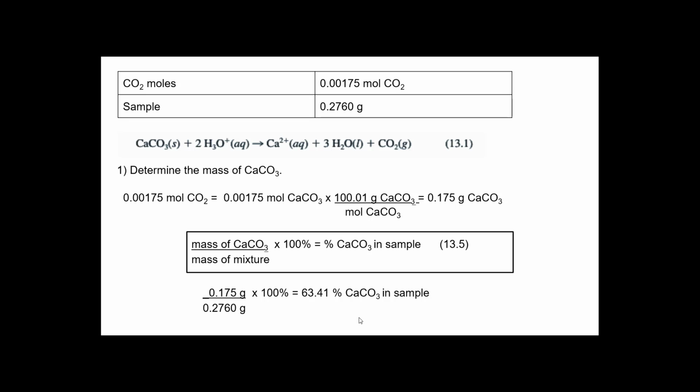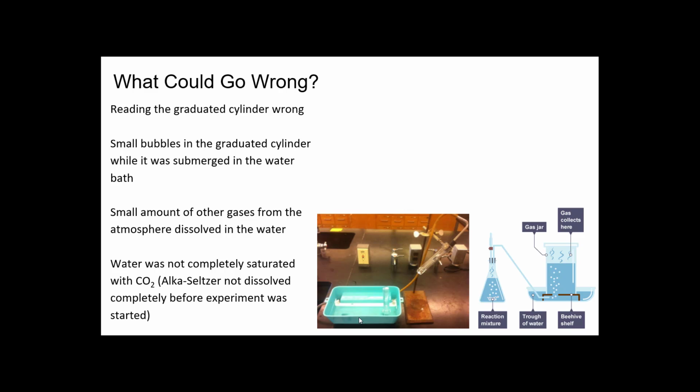But it's actually not a bad lab. I like this lab. It's pretty easy. And even though these steps seem like they may be a lot, they're really nothing that you guys have not already handled. You can handle this very well. What could go wrong? So I just left the slide in. This is for my class. Reading the graduated cylinder wrong, you're reading it upside down.